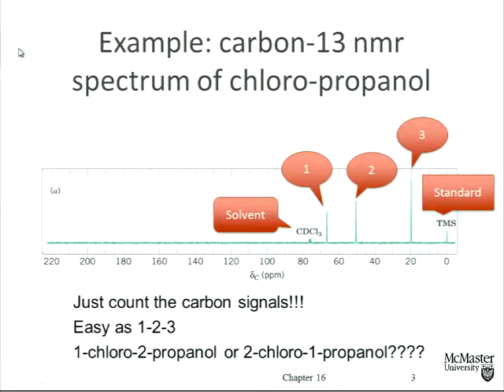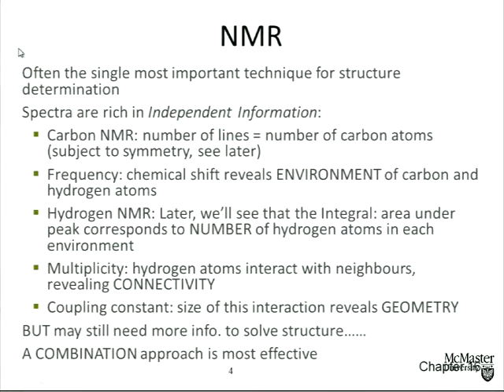But as far as you're concerned, this applies to every problem that you're going to solve in this course, and spectroscopy will continue as an exercise, usually in 2OB3. What we would like to do is work our way towards a molecular formula, at least, so that we know what sorts of structures are possible. If we've got the molecular weight but we don't know how many carbons are there, we're kind of stuck. If we have the molecular weight and the number of carbons, and in fact, as we'll see next week through proton NMR, the number of hydrogens, then I've got the number of carbons, the number of hydrogens, and the total molecular weight, and the difference tells me what other elements must be there. The difference is 16. That means what? Oxygen, right? Difference is 14, nitrogen. So by combining spectroscopic techniques and by applying carbon-13 NMR to problem solving, we can work our way towards the molecular formula.